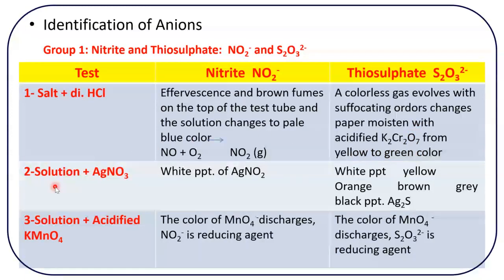The other tests are called the confirmation tests. You have to do them in a solution, plus silver nitrate.